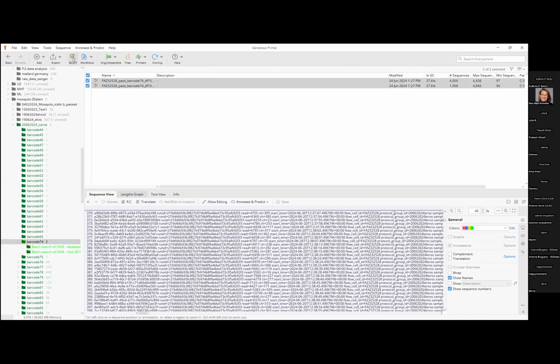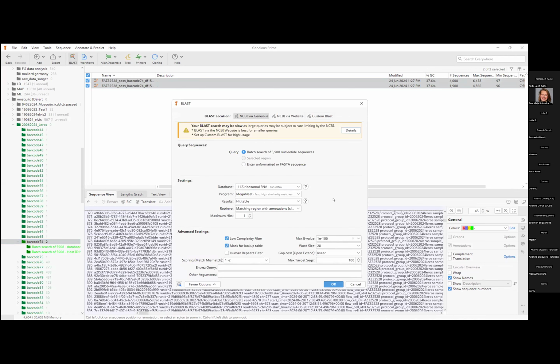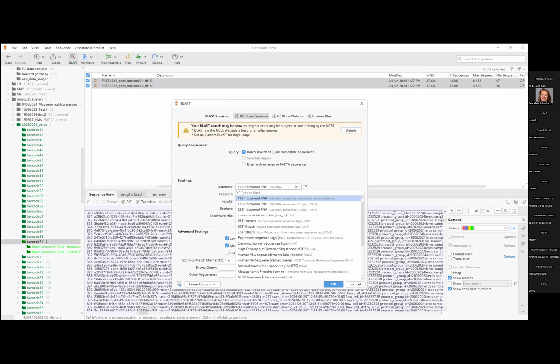Okay. Here on the upper left side, you can see BLAST. It's singled out because it's very commonly used. And then there's different ways to do this. So Geneious obviously wants to make your life as easy as possible, so it has created, let's say, the basic databases that you can use for your similarity search.